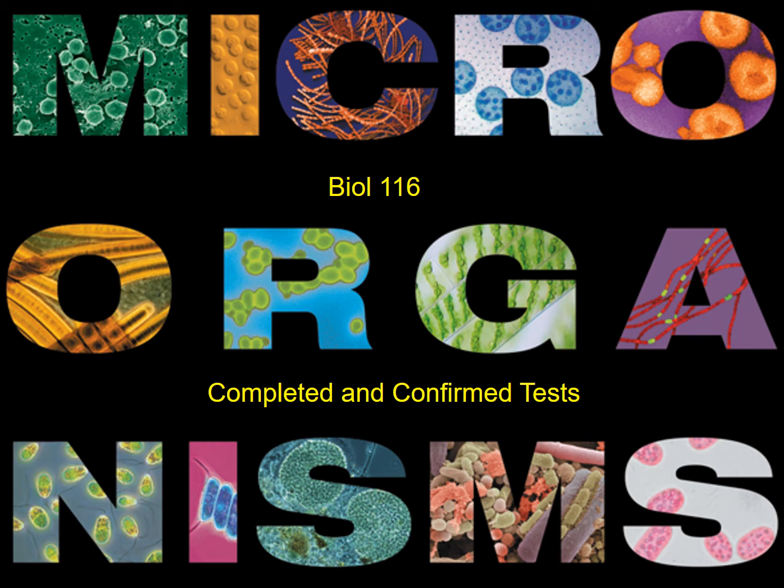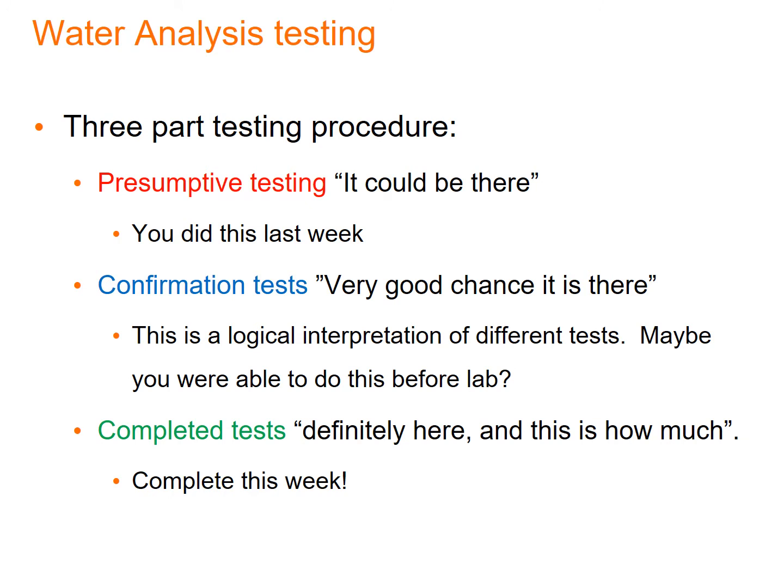Welcome back, microbiologists. This is our final week of experimentation in which we are going to carry out completed tests and confirmed tests for the presence of E. coli in water samples that led to gastroenteritis in the residents at the town of Beaufort on the Genesee River after the Great Flood this fall. So let's get back to water analysis testing.